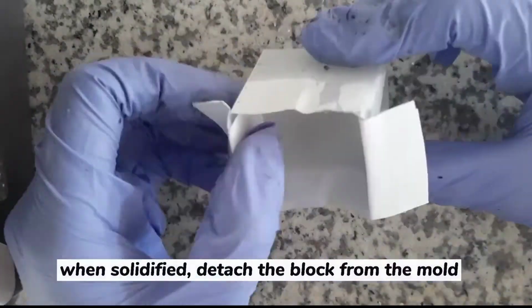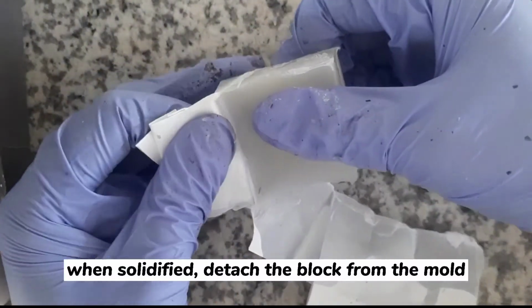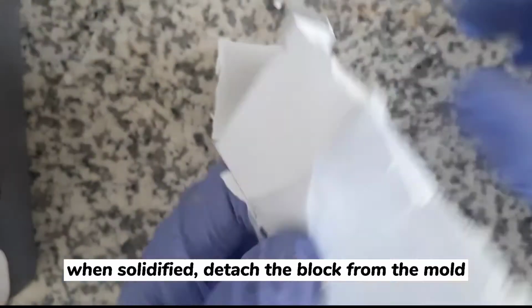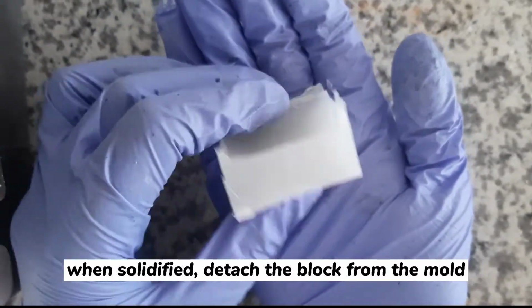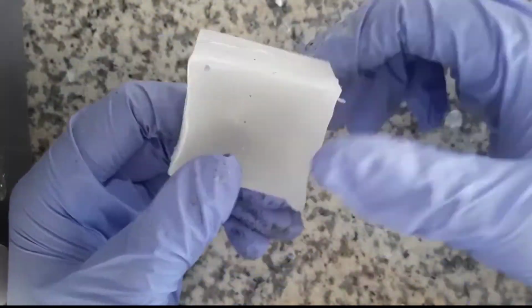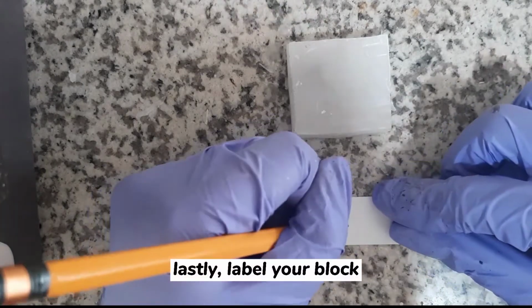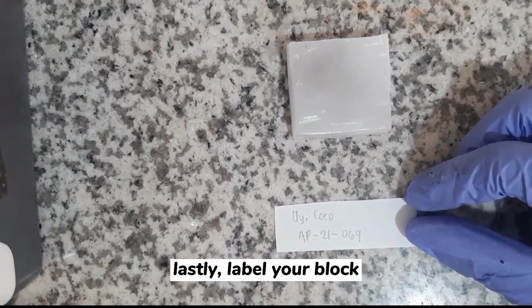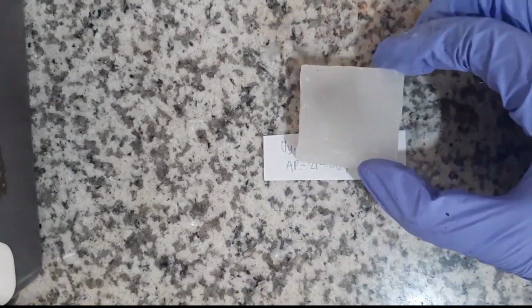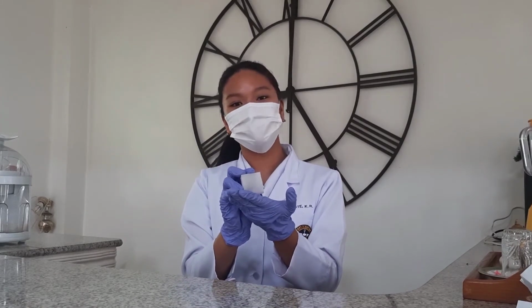When solidified, detach the block from the mold. And lastly, don't forget to label your block. And this is our finished product, a solid block of wax encasing a section of tissue.